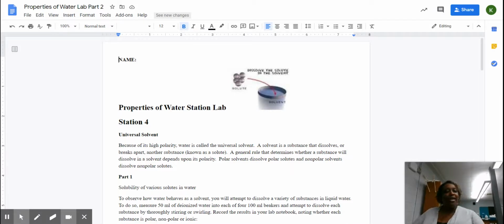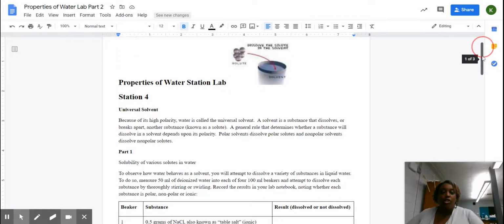Hello, and this is going to be your demonstration of the properties of water lab part 2. In this lab, I will demonstrate 3 different activities so that you can get a feel of what this lab was about. And then you'll be able to use this demonstration video to answer the questions that are found in your Properties of Water Station Lab Part 2 document.